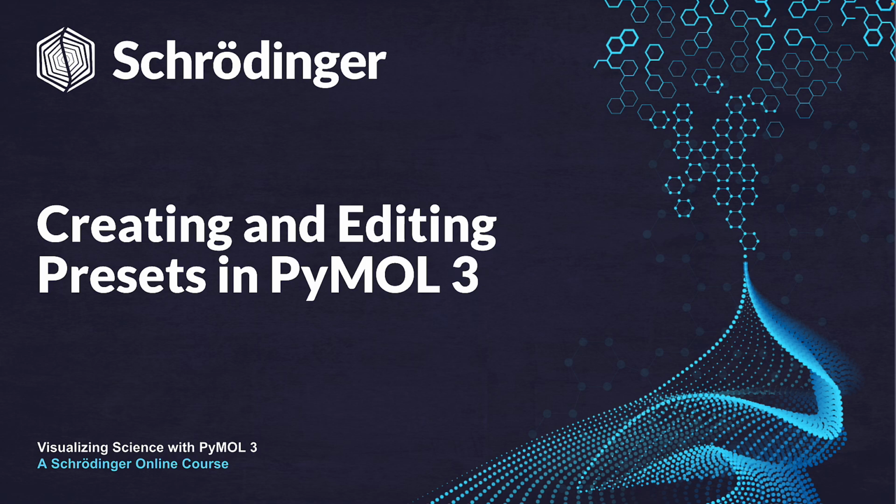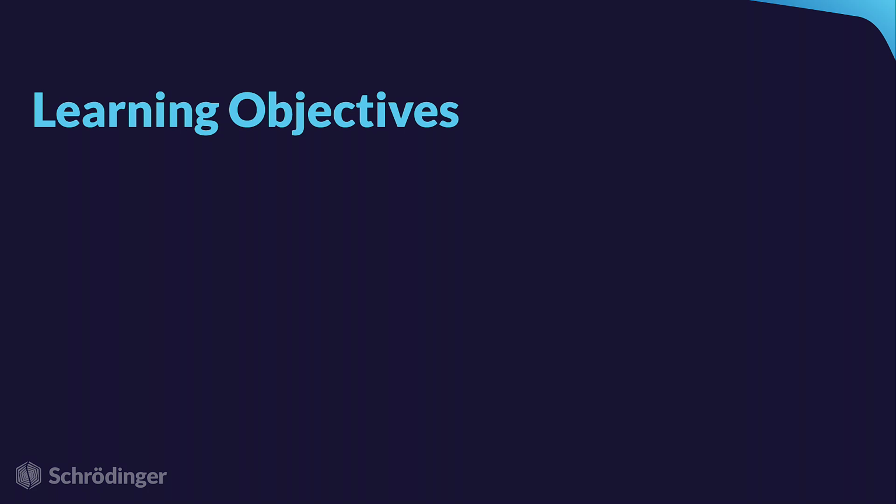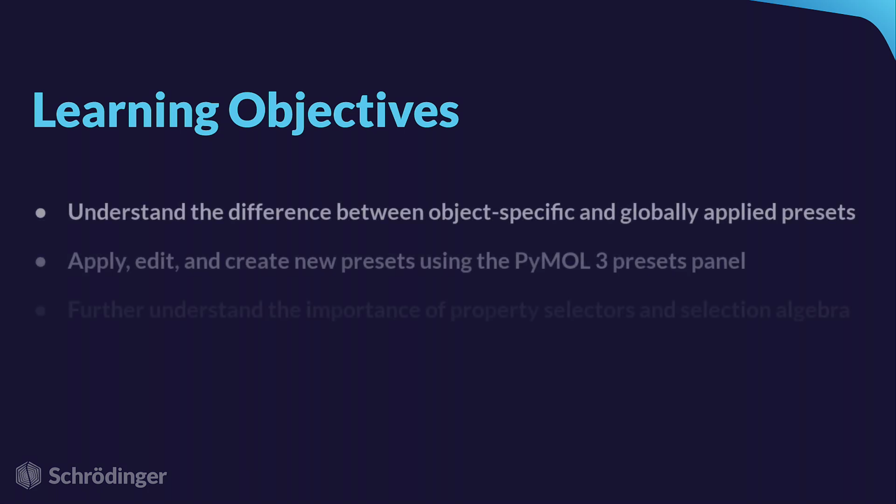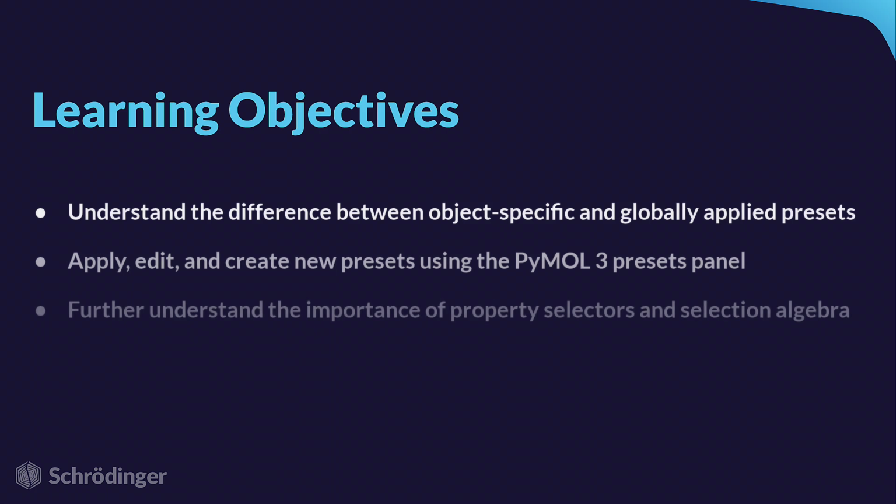Hello and welcome. In this video, we're going to take a look at the new presets panel in PyMOL 3. By the end of this tutorial, you'll be able to understand the difference between object-specific and globally applied presets, apply, edit and create new presets using the PyMOL 3 presets panel, and further understand the importance of property selectors and selection algebra.